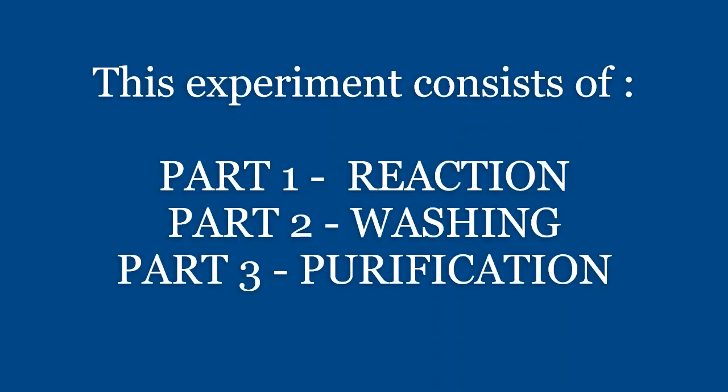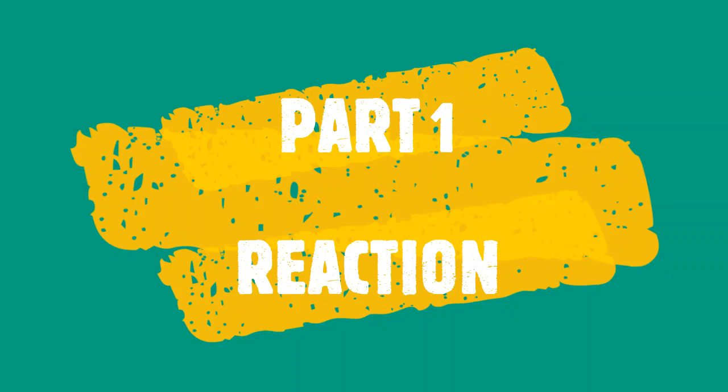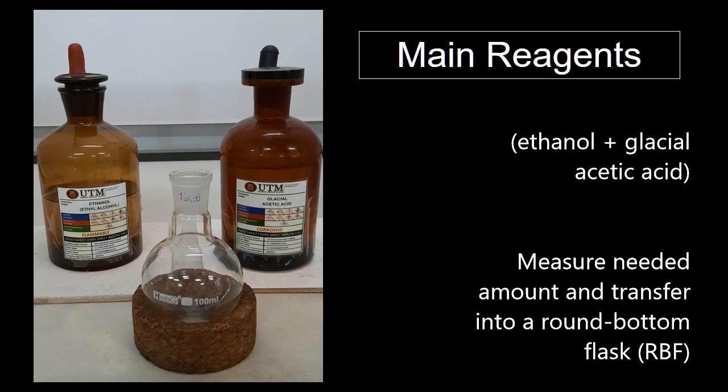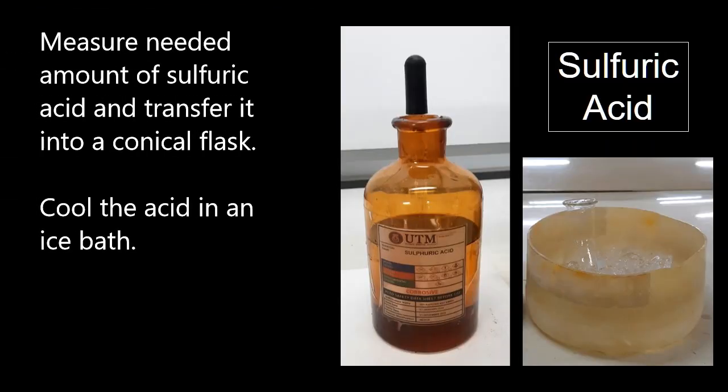The experiment will be divided into three parts: the reaction, washing, and purification of the product. These are the chemicals to be used in this experiment. Measure the amount needed and transfer both chemicals into a round bottom flask.